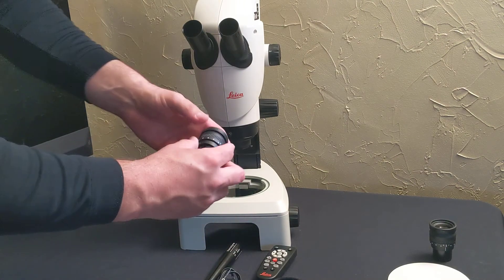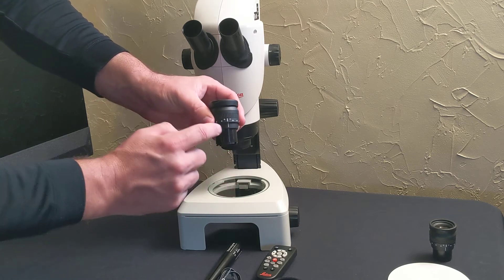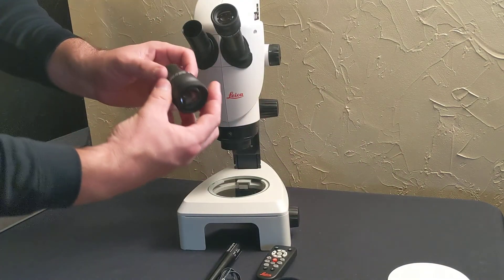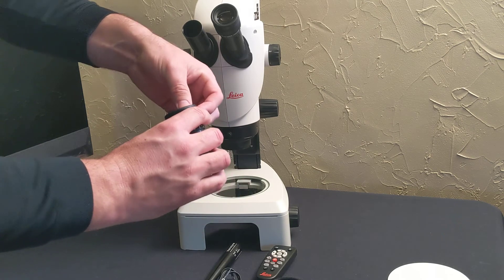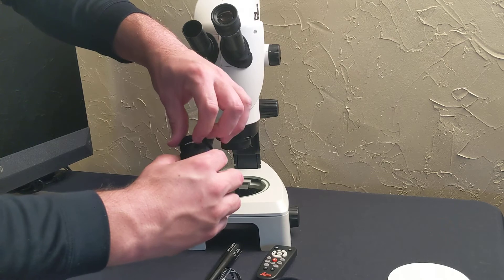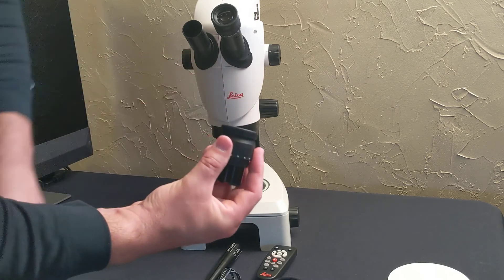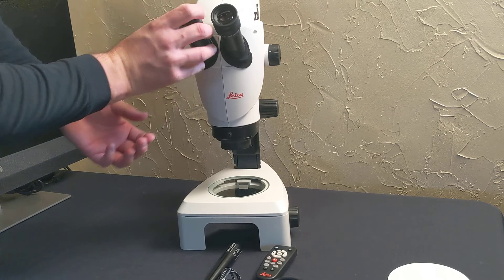On your eyepieces, line up the diopter settings so that there's zero. Sometimes your eye cups will be folded out — you can have them that way if you'd like, or you can fold them back down. Then slide those into the eye tubes and you pretty much have the scope built.